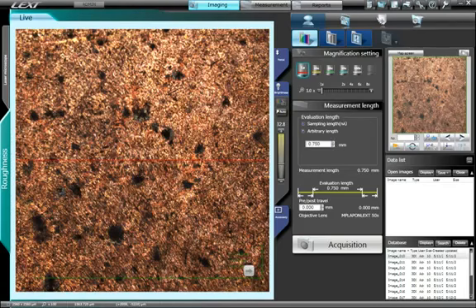The second method of defining the evaluation length is called arbitrary length. Here, you simply enter the value of the evaluation length without any cutoff values. In both methods, you can optionally program in values for pre- and post-travel.